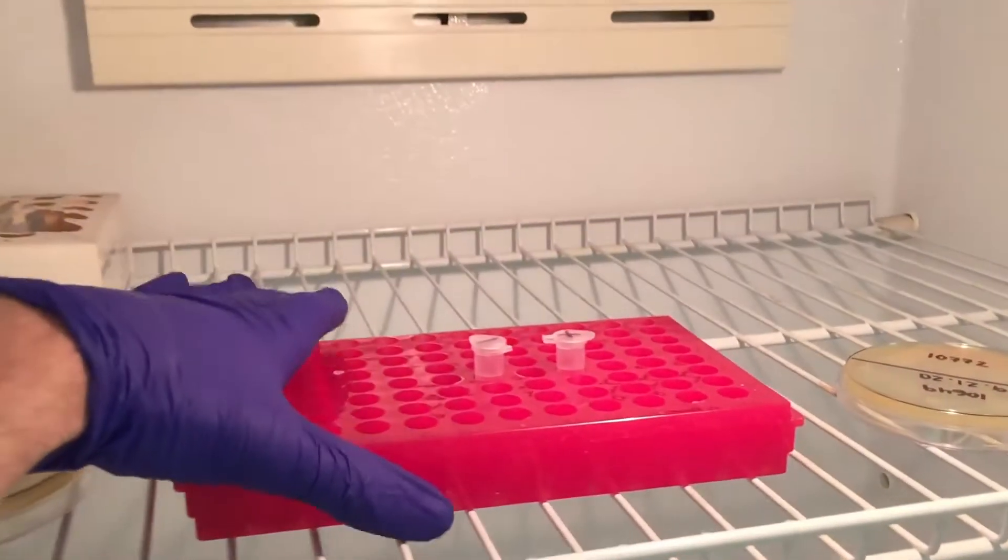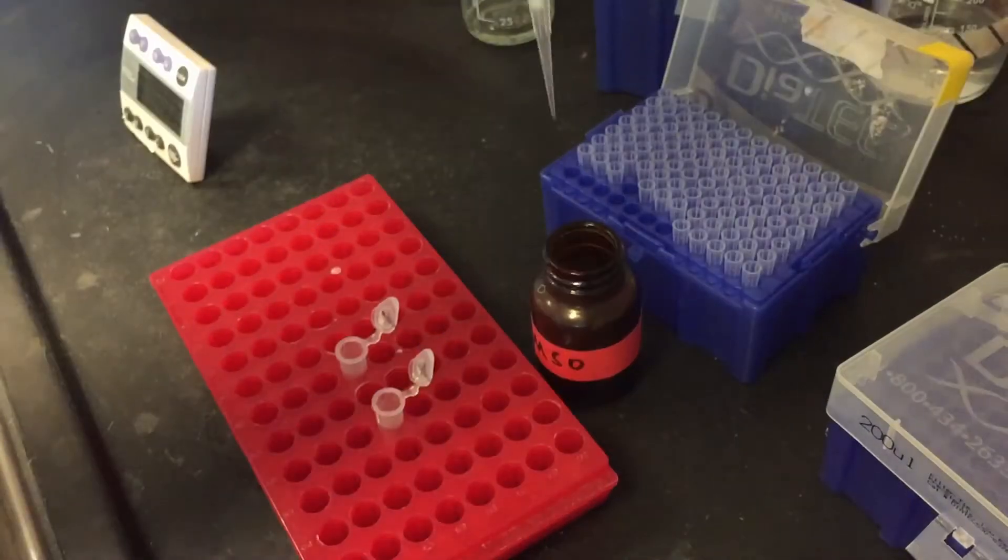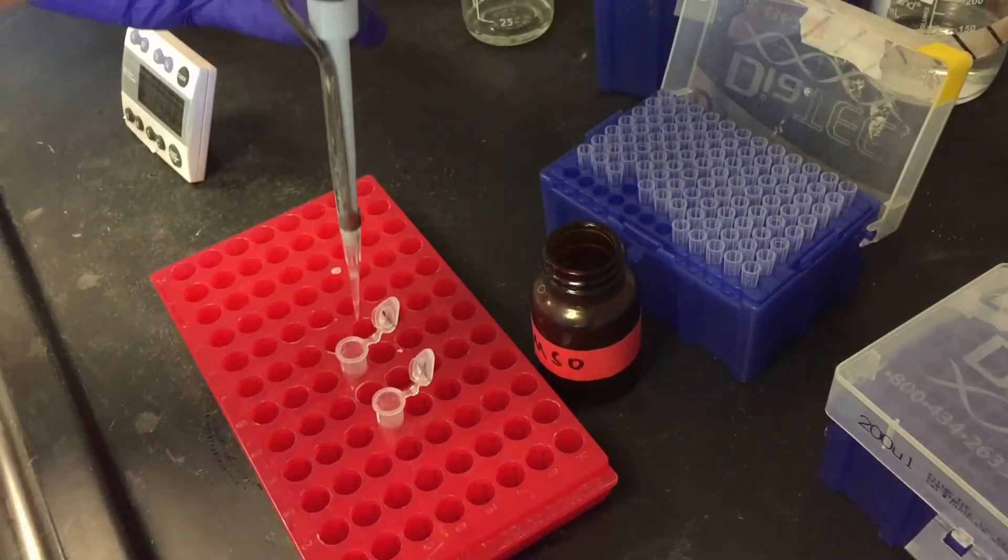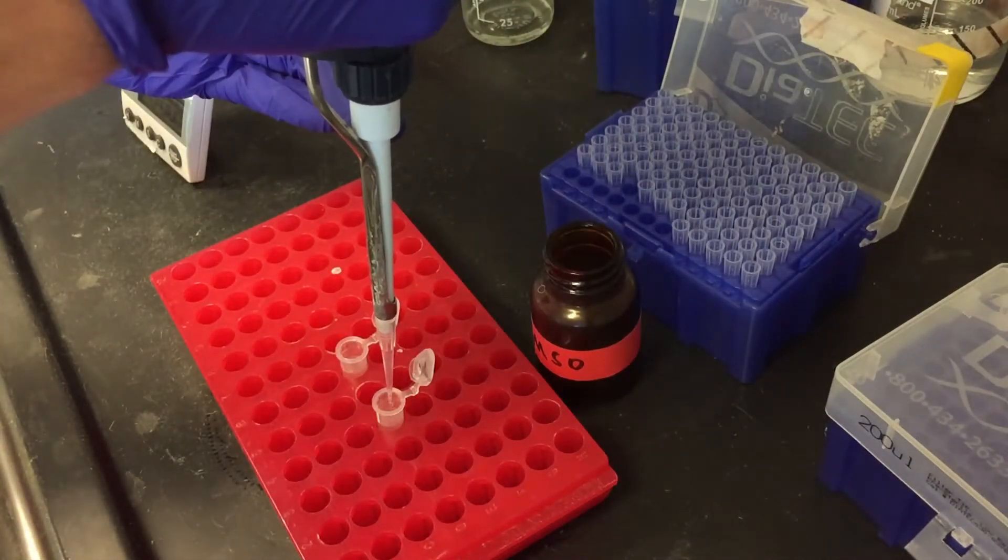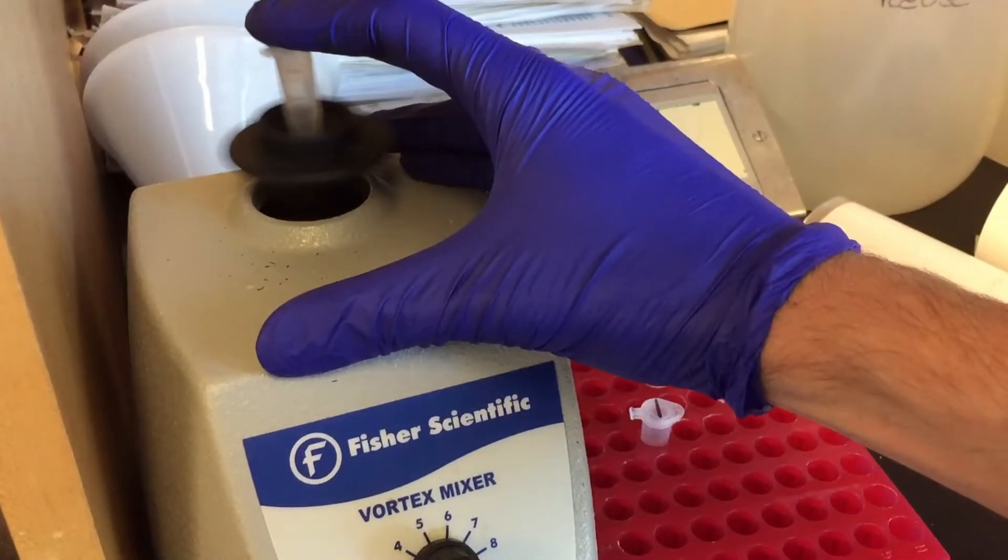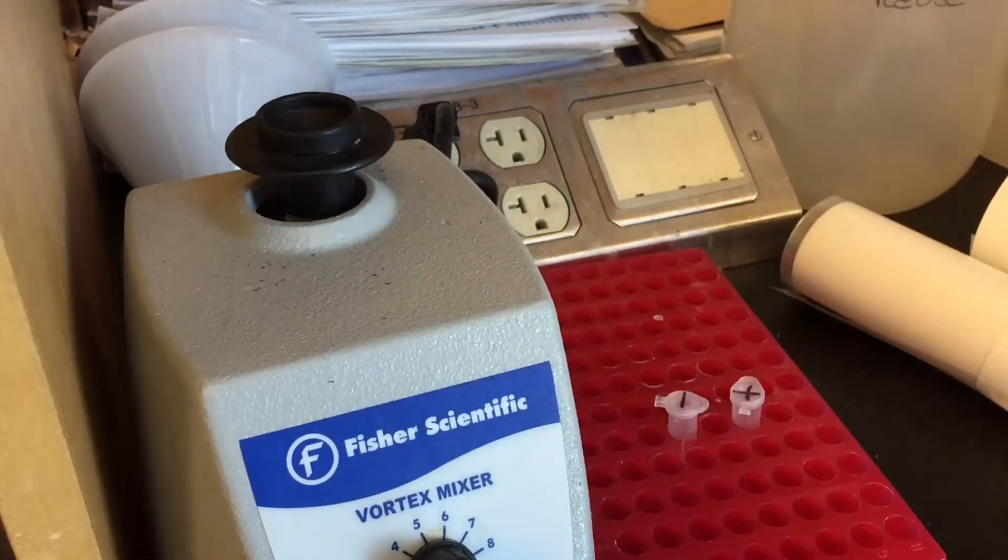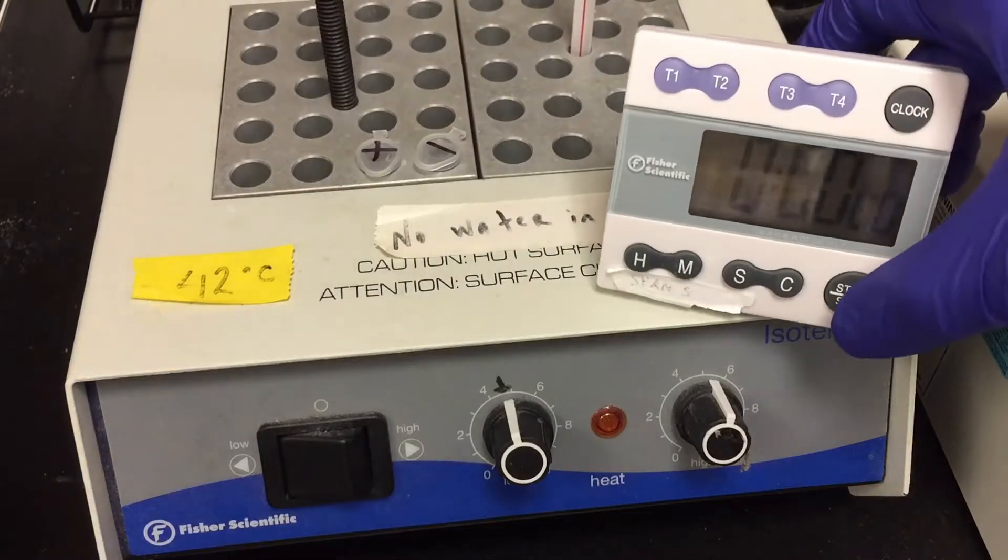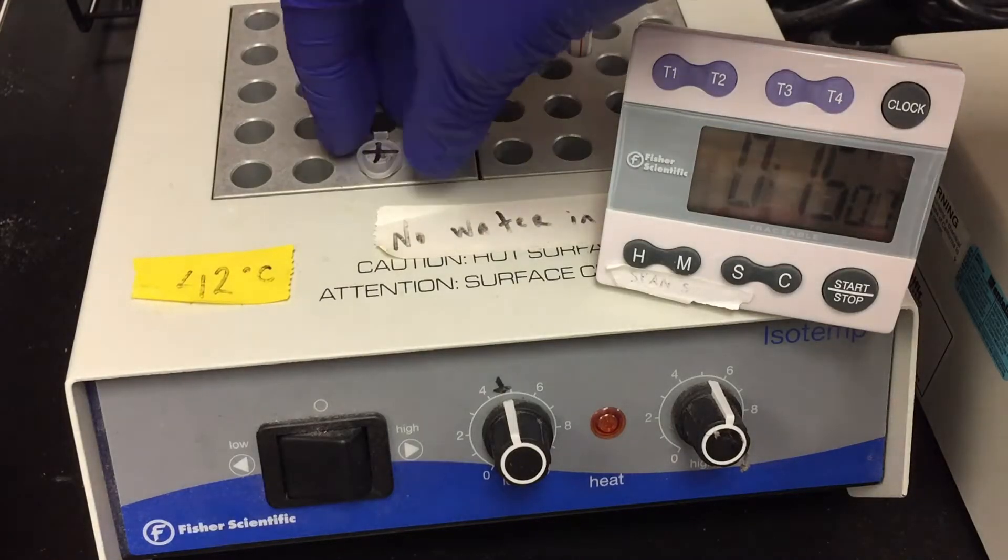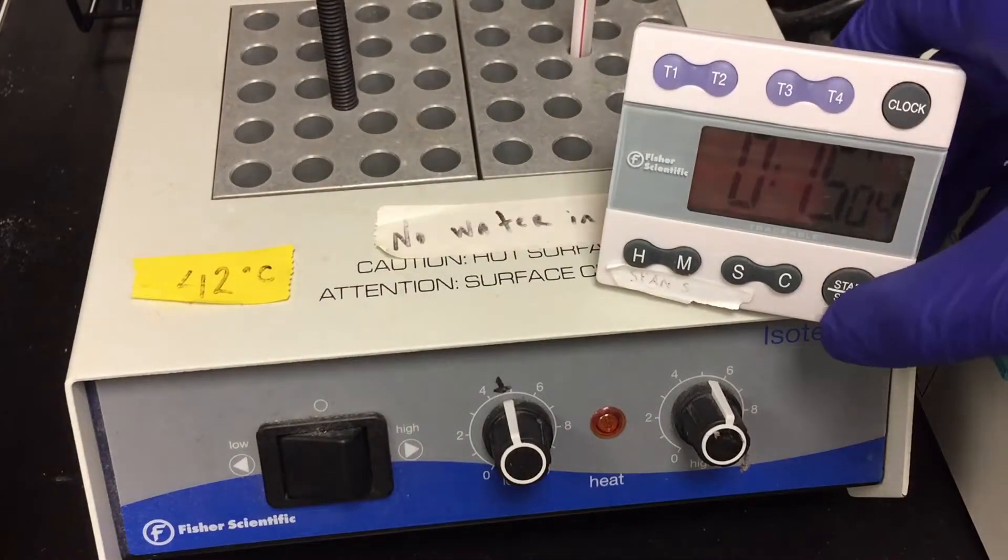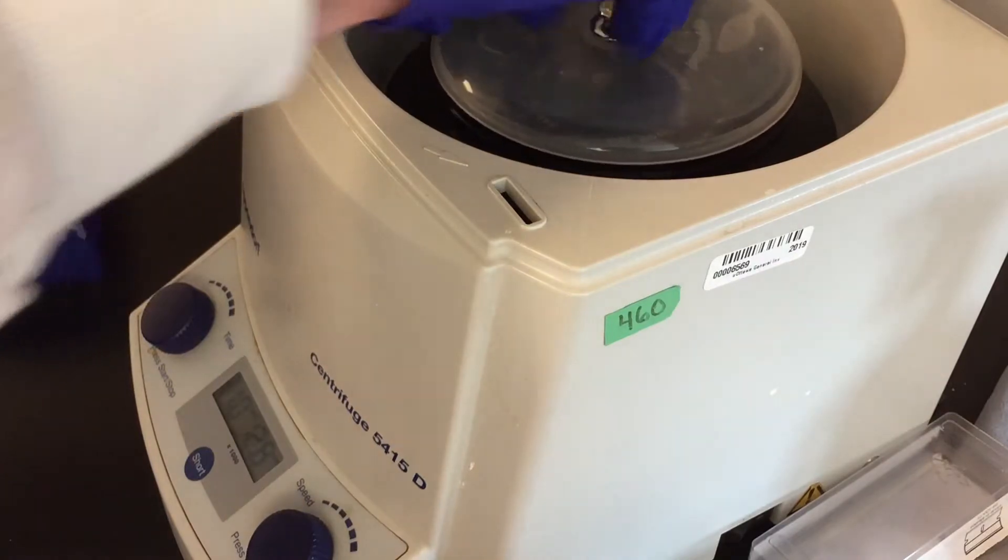After the incubation time expires, add 60 microliters of DMSO to each tube. Vortex well and incubate at 42 degrees for 15 minutes. Harvest cells by centrifugation and carefully aspirate away the PEGMIX.